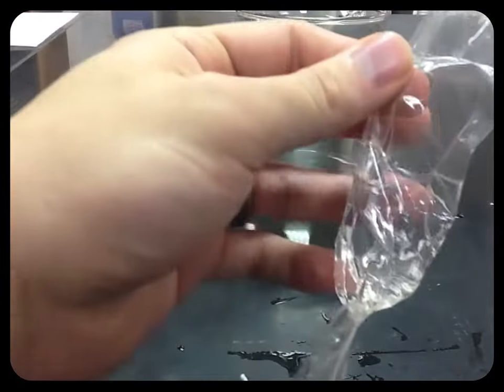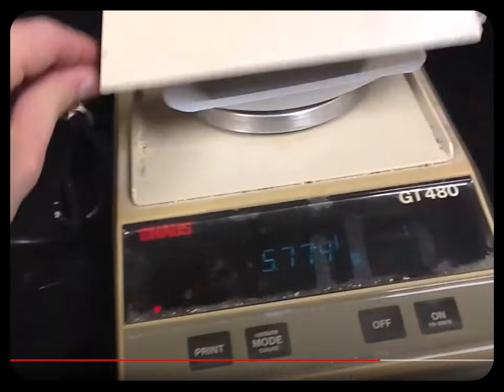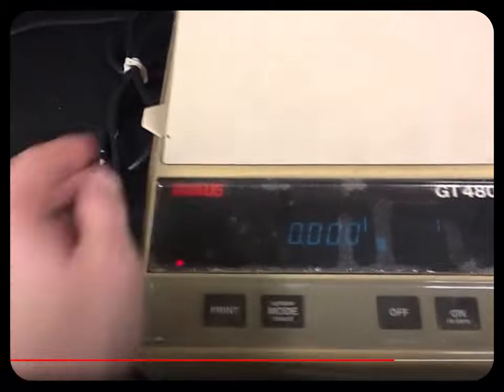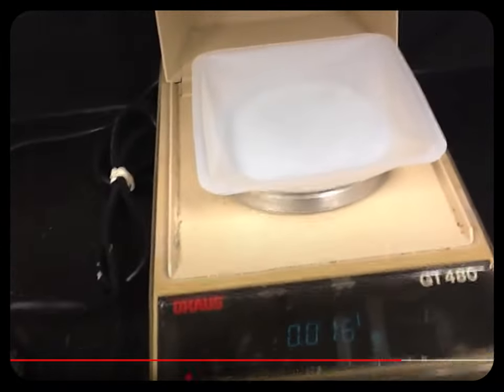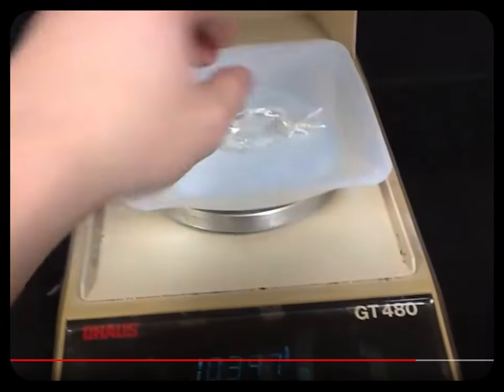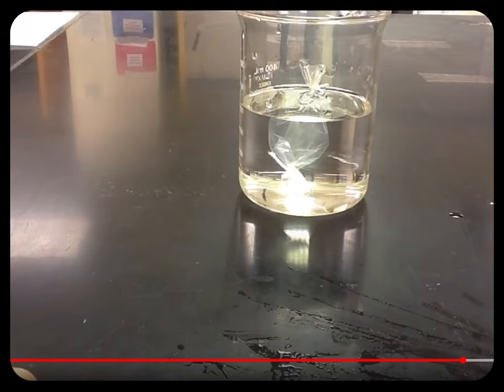So he's about filled it up here, and he's going to tie off the end, and then you're going to weigh it. So this is a balance, and it's just like your bathroom scales. You got to set it to zero first. Okay, once you got it set to zero, then you're going to put that dialysis tubing on it. There it is. So it has a certain amount of fluid inside of it, and we write down what the weight is. So once you've weighed it, you've put it into a beaker. We're going to put one that has water inside the tube and water outside. So we're going to see 40 minutes later.